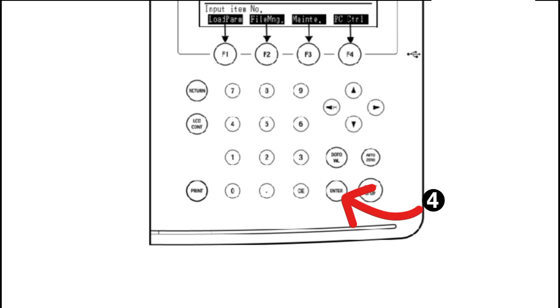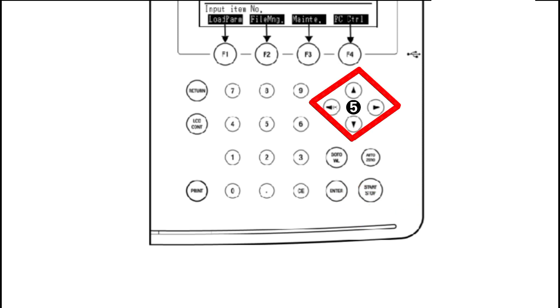Number five, left, right, up, down cursor or the arrow key for moving the cursor in the LCD screen left, right, upward or downward. The left cursor key can also be used for entering negative numeric values.